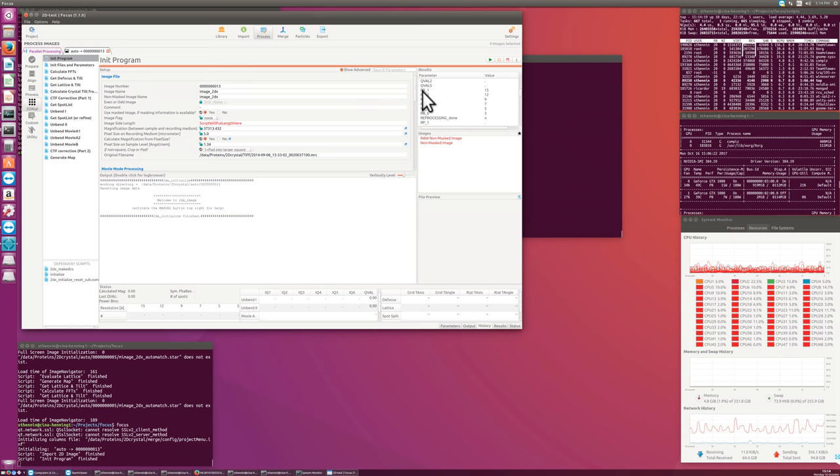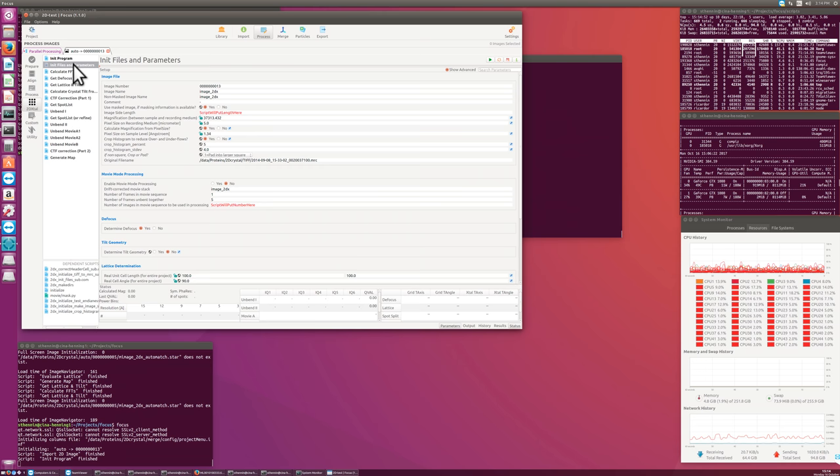So these parameters, some of them are interesting as default parameters. They are computed based on the image size and pixel size and some other things. But many other values are just reset to zero. The image side length, for example, is not yet known, as the script will put a number or length there. There's a magnification now, which is correct, but init files and parameters is the next script we need to run.